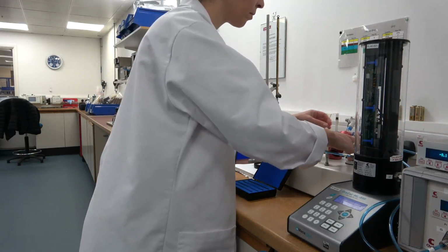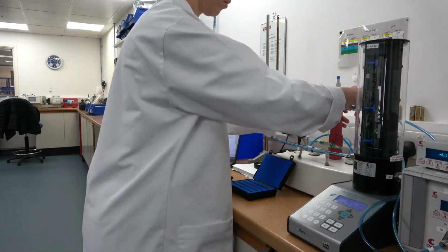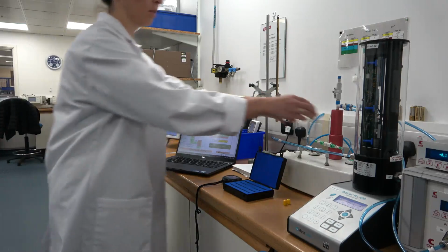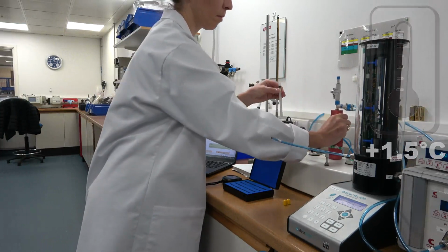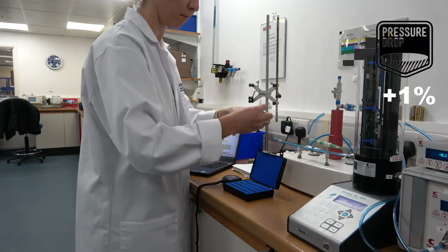It's very important not to handle the PD and ventilation standards for any longer than necessary, as these standards are extremely sensitive to temperature when held in hand. Holding a standard for only 5 to 10 seconds can cause a temperature increase of about 1.5 Celsius degrees, with a consequent increase in pressure drop of up to 1%.